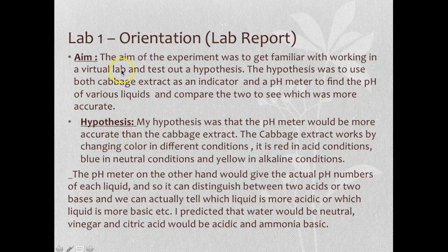So the aim here was to get familiar with the virtual lab environment as well as to use both the cabbage extract and the pH meter to find the pH of the various, I would call it solutions rather than liquids, and compare them to see which of them would be more accurate in determining pH.